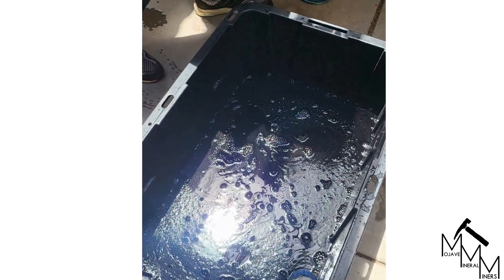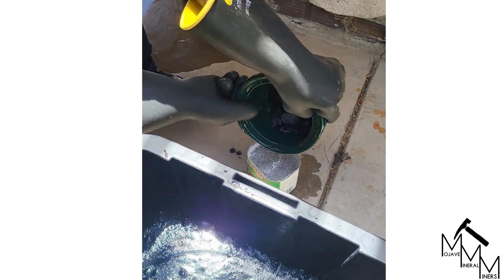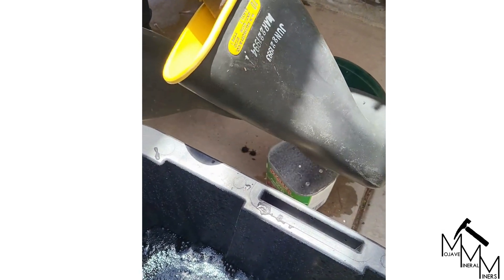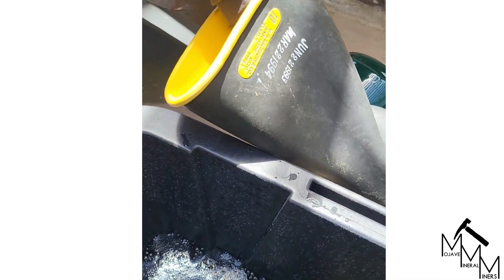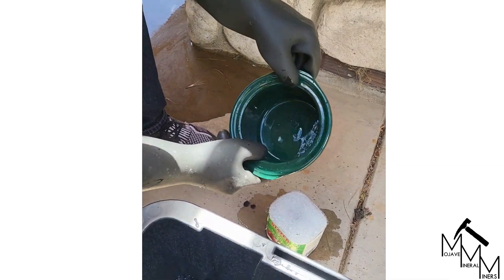Now this is dilute sulfuric acid, and now we're pouring the opal into our sodium bicarbonate solution. Let it fizz, let it do what it needs to do.